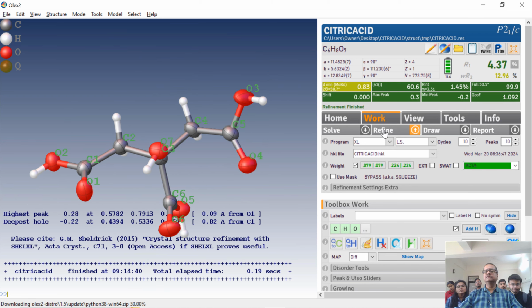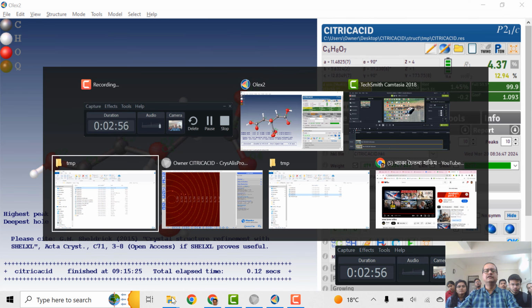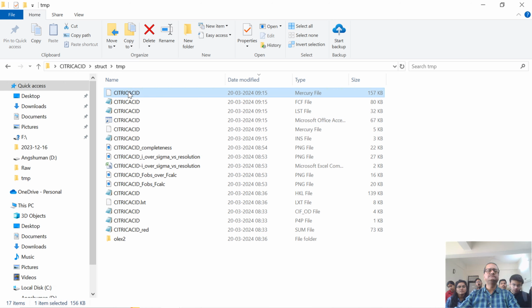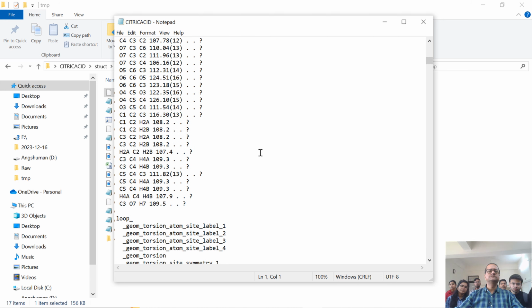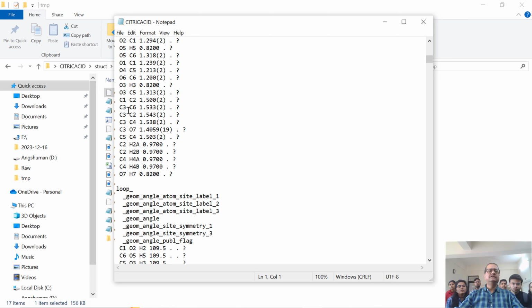So now when you have generated the hydrogens by geometry, you go back and open your CIF. Straight away go down to where it talks about the bond lengths. When it talks about a CC bond length, the bond length has a standard deviation.